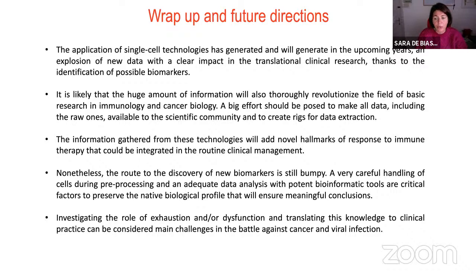because, of course, we have to pay a lot of attention to how we handle all the cells during pre-processing, and adequate data analysis with proper bioinformatic tools are critical factors to preserve the native biological profile that will ensure meaningful conclusions. And finally, investigating the role of exhaustion and/or dysfunction and translating this knowledge to clinical practice can be considered main challenges in the battle against cancer and viral infection.